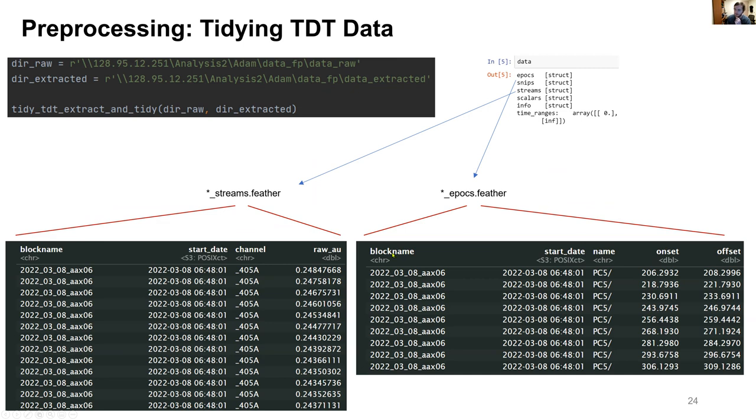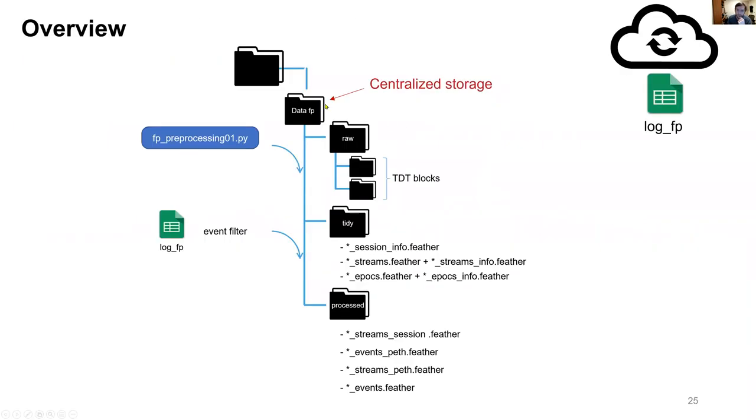And then the same thing goes for your epochs. So these are your events. Again, you have all your events for the first input on top of the second, on top of the third. And then you just have the name or the identity here as a variable. So that first step is completely agnostic, like we were talking about earlier. It just takes that raw data, automatically chunks through it and converts it into a format that's easier to work with. The next one is not completely agnostic.